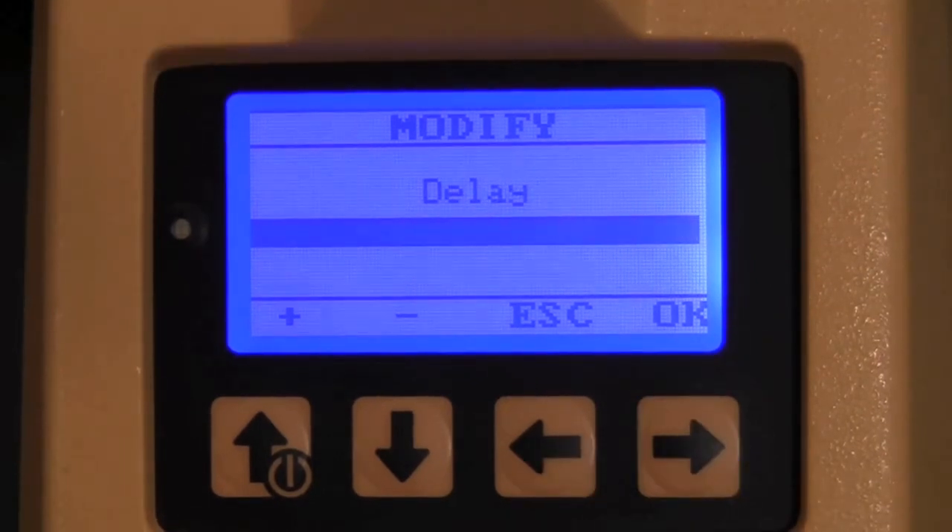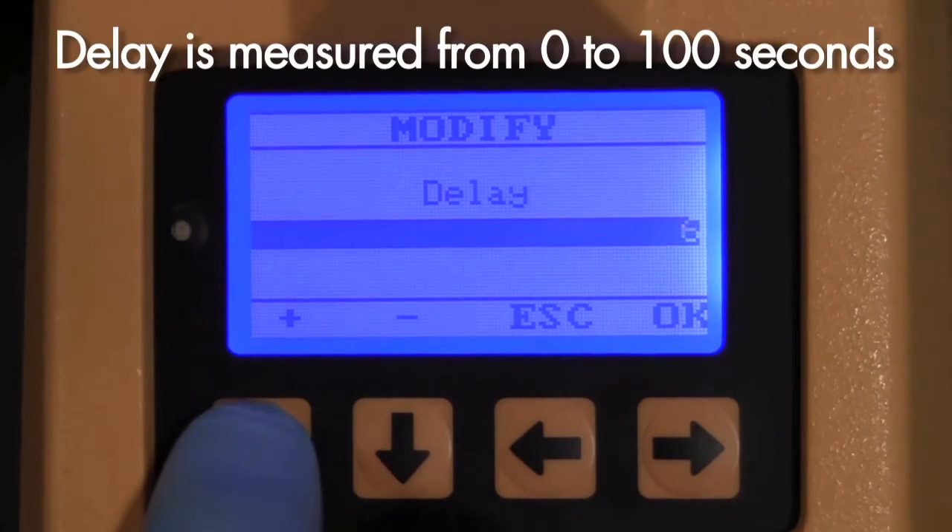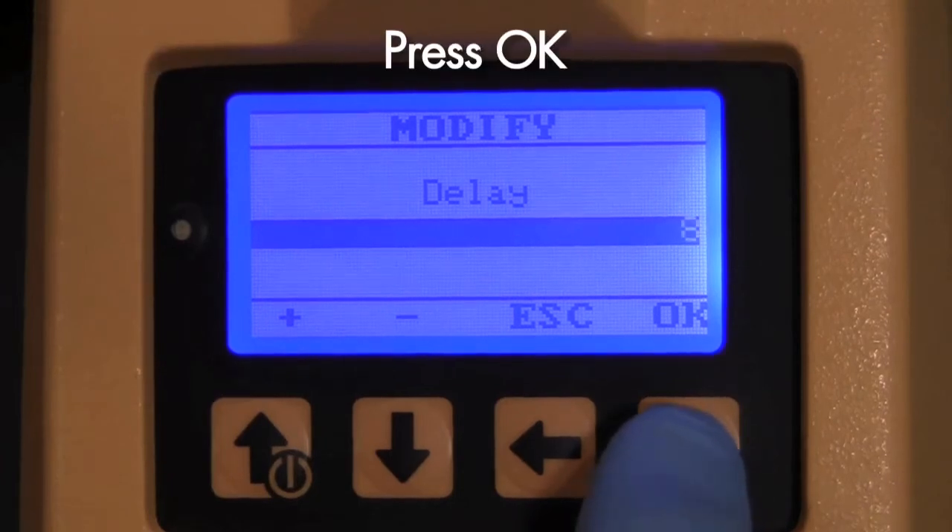Now the instrument will allow you to select a delay time. Selecting a delay time can be useful for setting up the unit prior to leaving your clean room or having technicians begin their processes. Delay is measured from 0 to 100 seconds. Press OK to confirm the value.